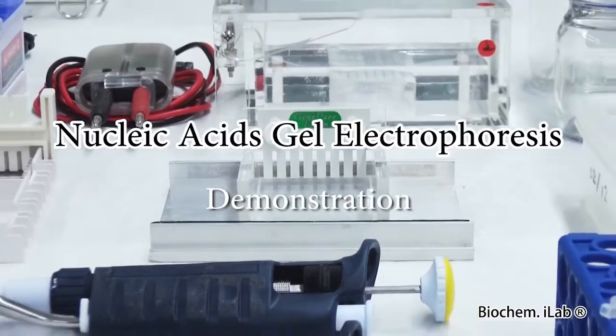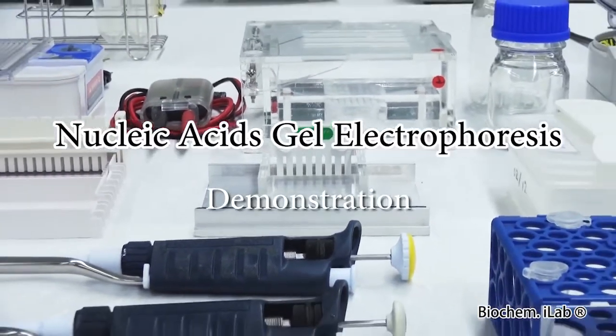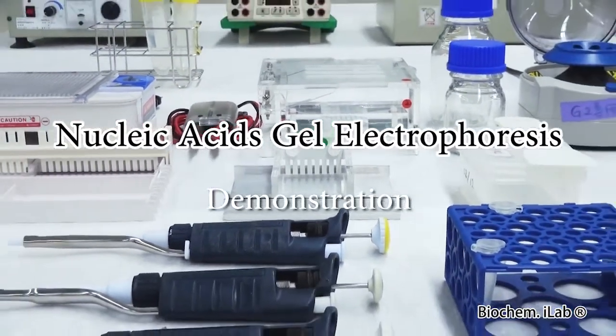Hello. In this video, we'll demonstrate horizontal gel electrophoresis for nucleic acids.